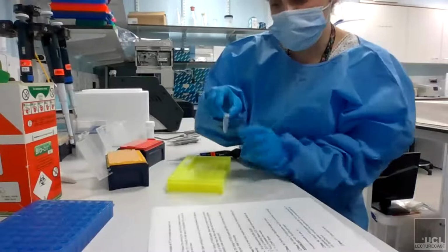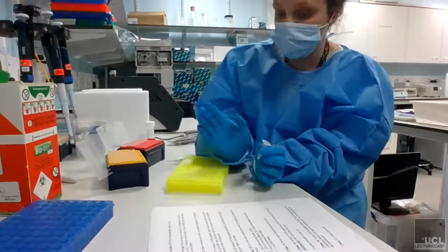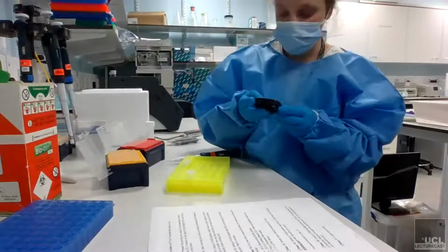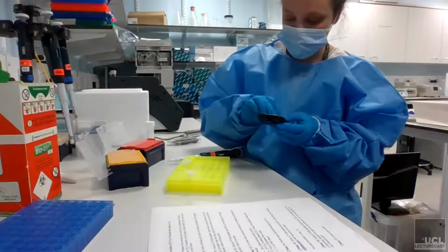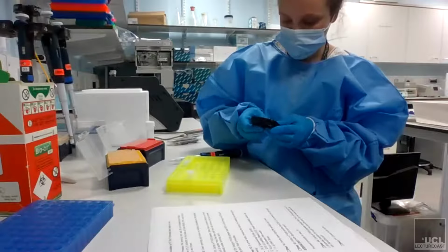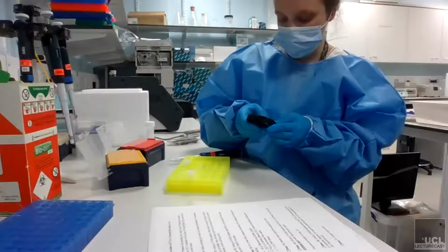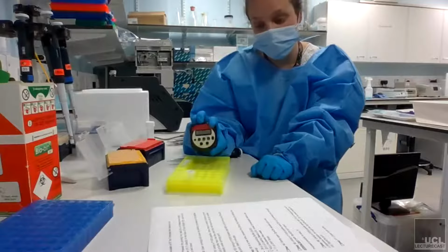Now we're on to the second page. What we're going to do is incubate this at room temperature for 5 minutes. As I say, I believe that's what helps it attach the adapter to the DNA. There we go, 1, 2, 3, 4, 5. So you just leave that for 5 minutes at room temperature.